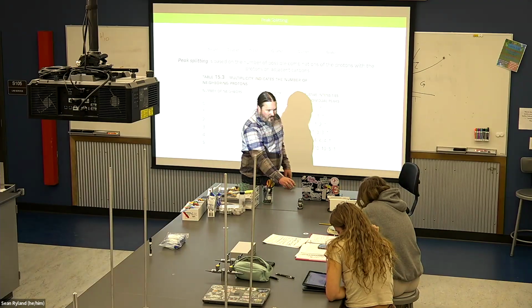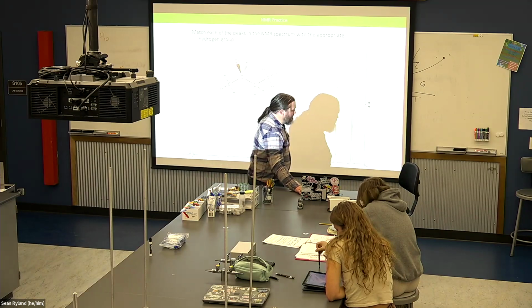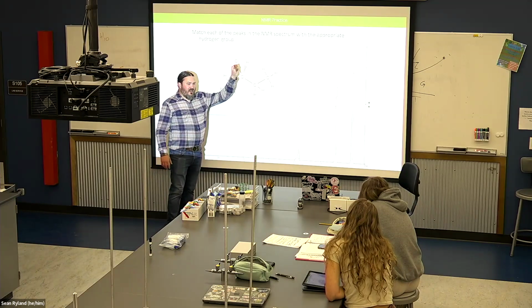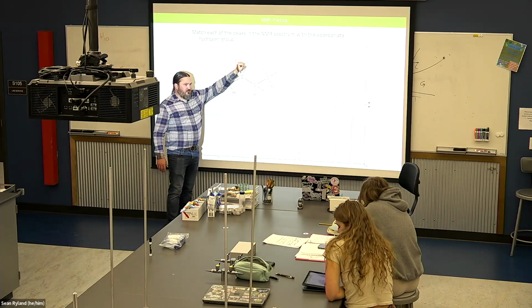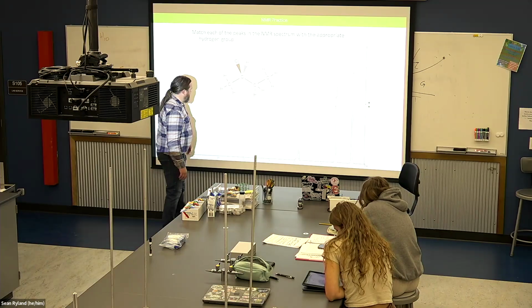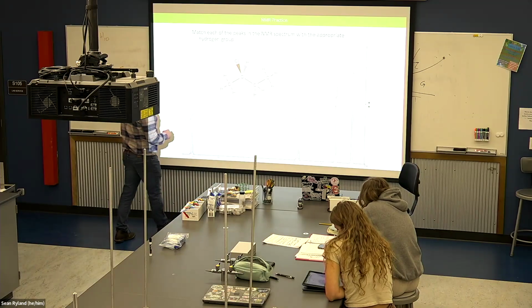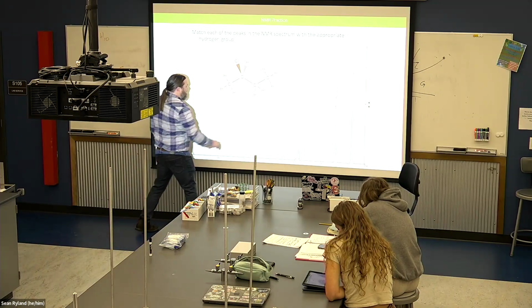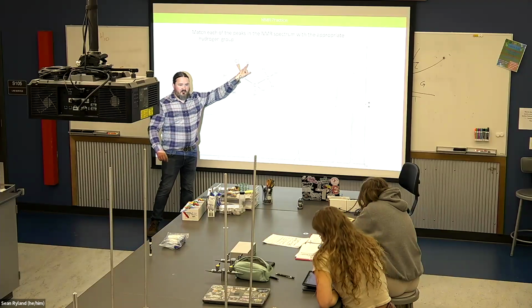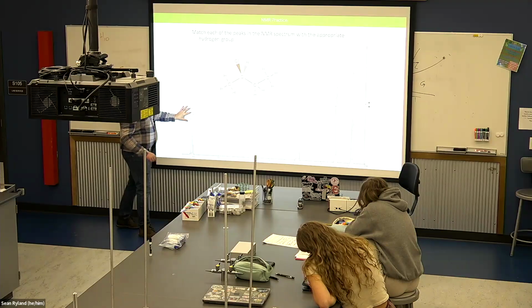And this is why we're doing the examples, because we're only looking at hydrogens as nearest neighbors. How many hydrogens are attached on the alpha carbons relative to our signal? So 1, 2, 3, 4, 5. So we should see a peak of 6. There's only one hydrogen in our signal, so it should have an integral of 1.